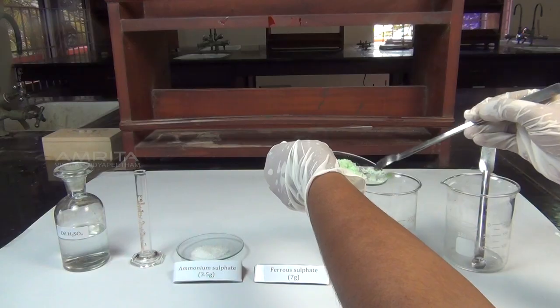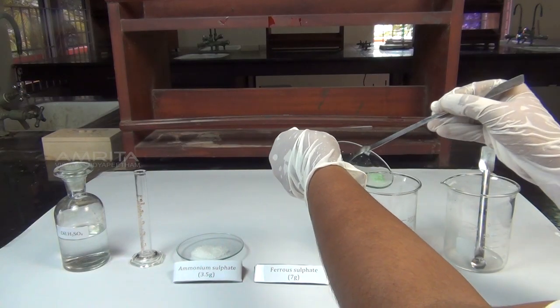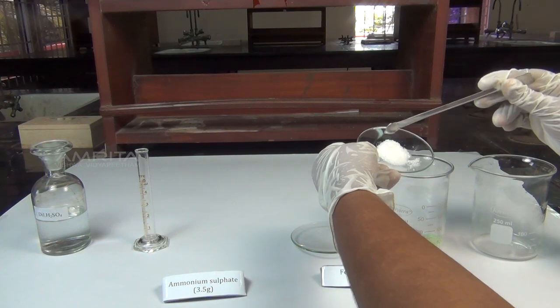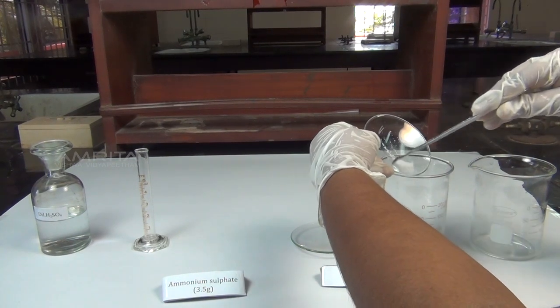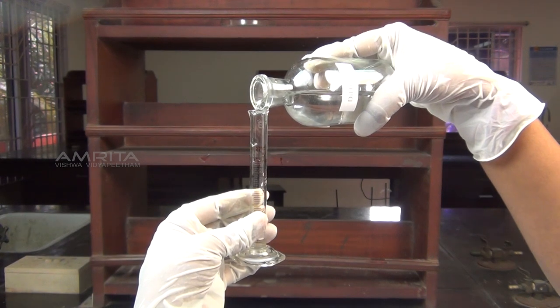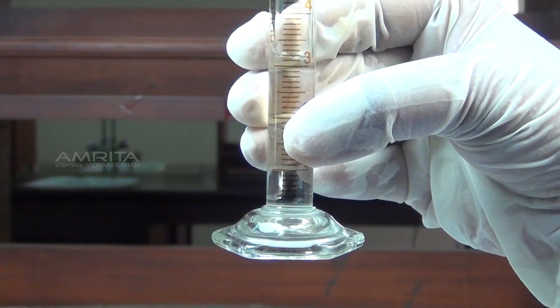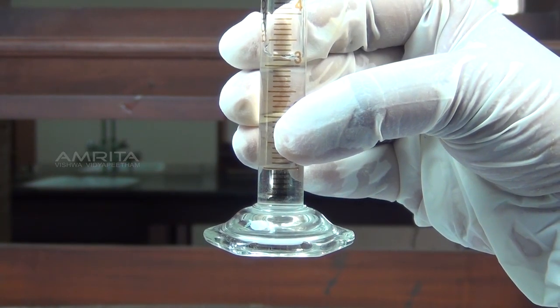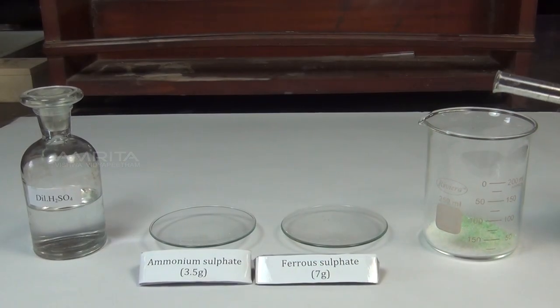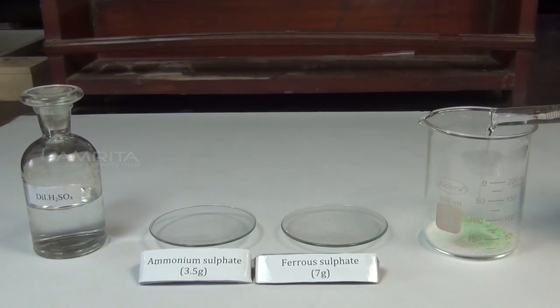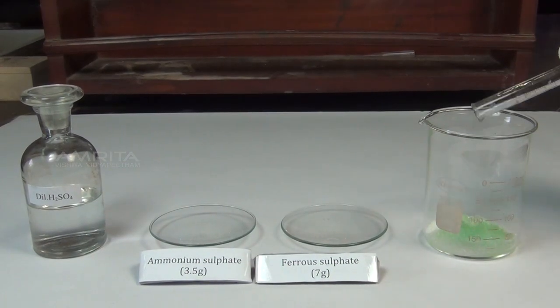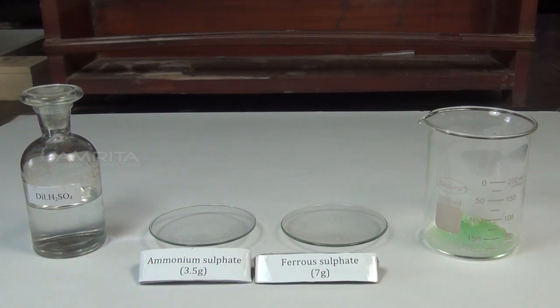Procedure: Take about 7g ferrous sulphate and 3.5g ammonium sulphate in a clean 250ml beaker. Measure about 3ml of dilute sulphuric acid in a measuring jar. Add it into the beaker containing ferrous sulphate and ammonium sulphate to prevent the hydrolysis of ferrous sulphate.